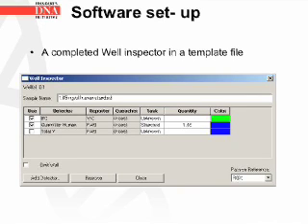Here we have a screenshot of a completed well inspector in a template file. Notice that the sample name is already filled in, the quantity is already filled in, under task, standard is there, and it is checked for Quantifiler Human and IPC. That means this is a well inspector for a human standard.